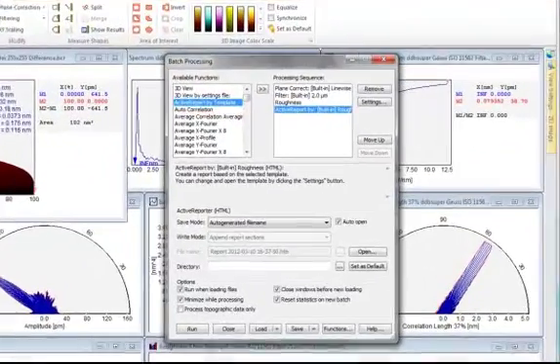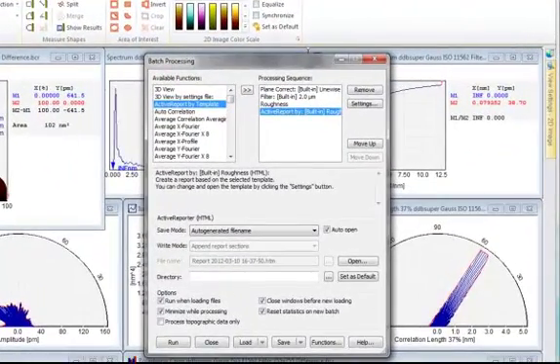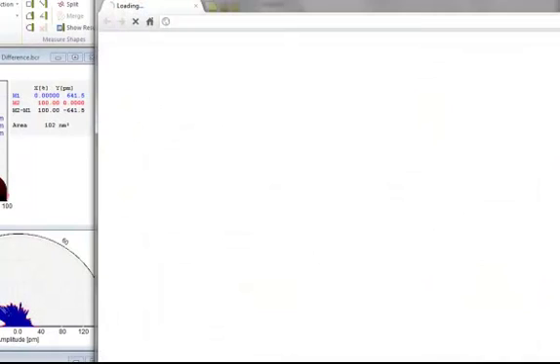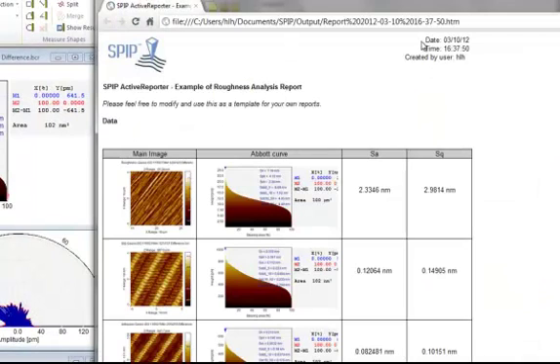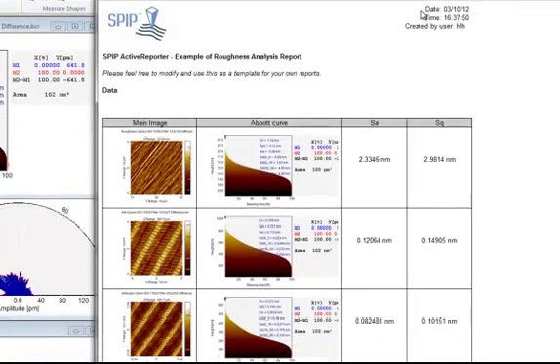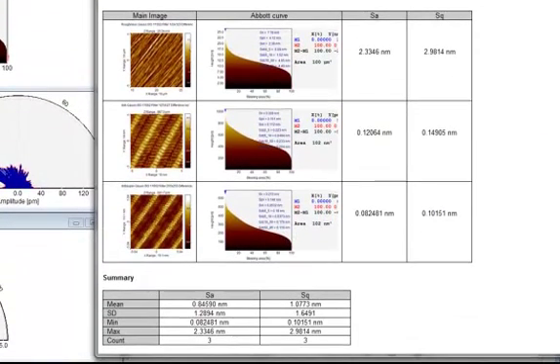Now, SPIP has generated a roughness report for the selected images. Thank you for your attention.